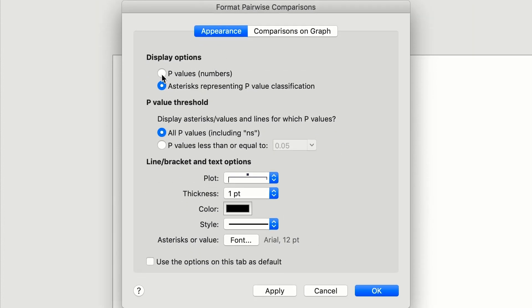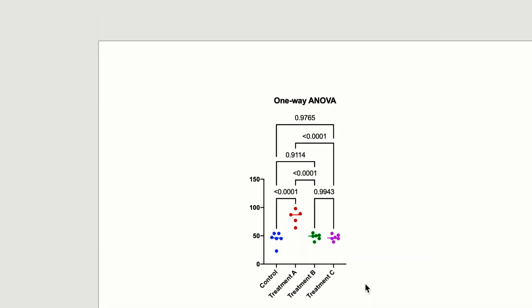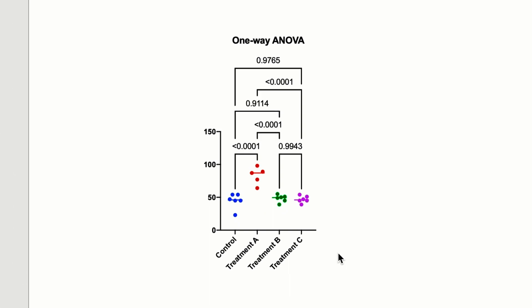Or choose to display p-values instead of asterisks. And note, if you make adjustments to the data or analysis, the results displayed on the graph will update automatically.